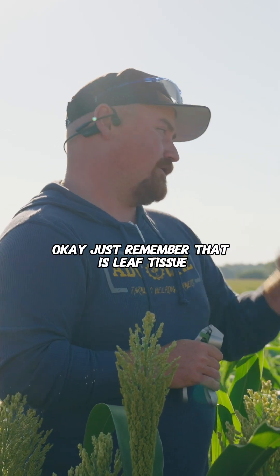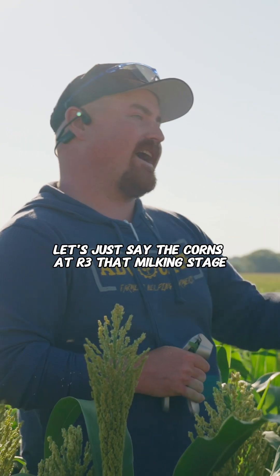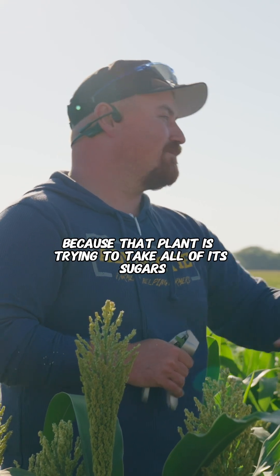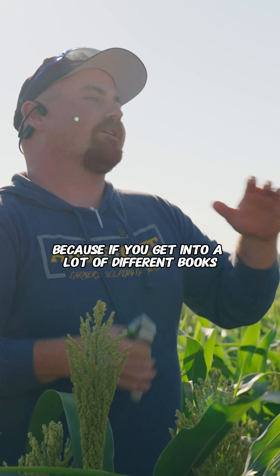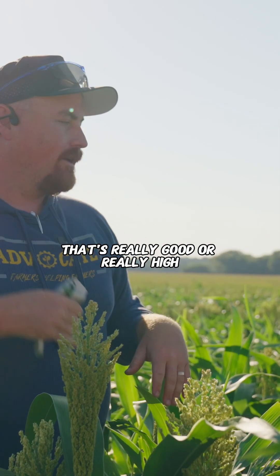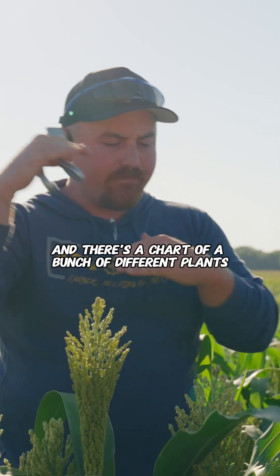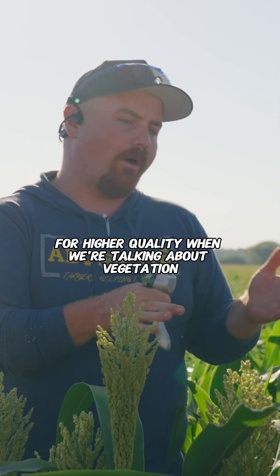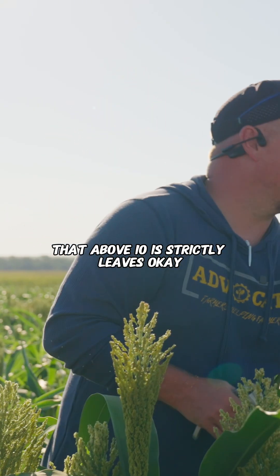Just remember that as leaf tissue — that 10 to 12 threshold — because what I could do is go to a cornfield and, let's say the corn is at R3, that milking stage, I could take that and probably get a 20 from the ear, because that plant is trying to take all of its sugars and put it into that ear. If you get into a lot of different books, they talk about how sweet corn needs to be a 22 — that's really good or really high. That's from the fruit. So if you're reading it from books and there's a chart of different plants, more than likely that is where they want the fruit to be at for higher quality. When we're talking about vegetation, above 10 is strictly for leaves.